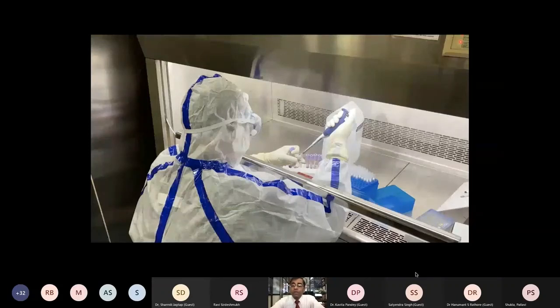In the COVID project, we had no idea what peptides and proteins they were going to look for as disease severity prognosis. So we had to start from scratch, and that's where we needed to do depletion mandatorily, because otherwise we are going to lose all the low abundant proteins. We have no idea for this disease what can be a potential biomarker.